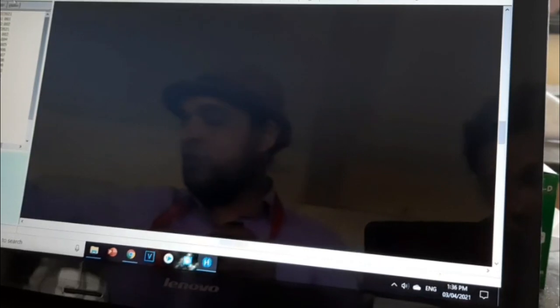It is so portable that you can take it anywhere and observe directly on your mobile as well, but right now we are viewing on the laptop. I'm adjusting the focus knob. We've observed the thrips and now we will look at one slide — the rat flea.